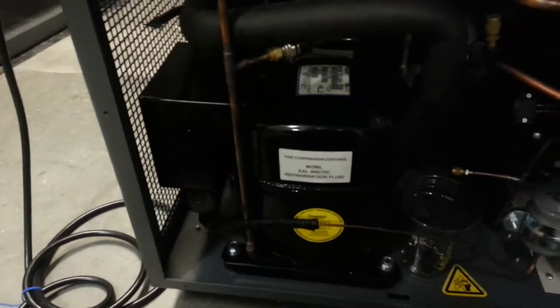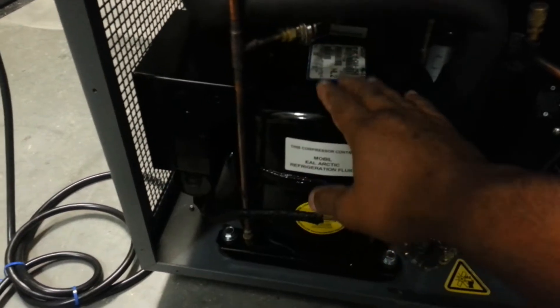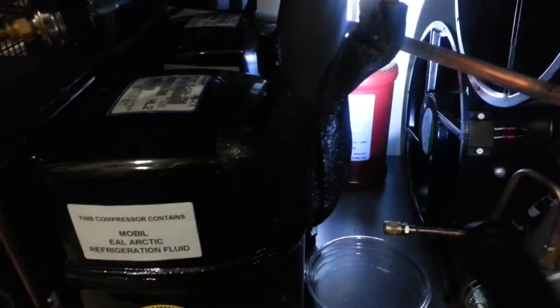We've got two compressors here. This is called the second stage. How do we know it's the second stage? Because we have an oil separator over there — that's your oil separator. If you follow your tubing, always check your tubing — it goes back into this compressor. Your second stage always has the oil separator, most of the time with this manufacturer.